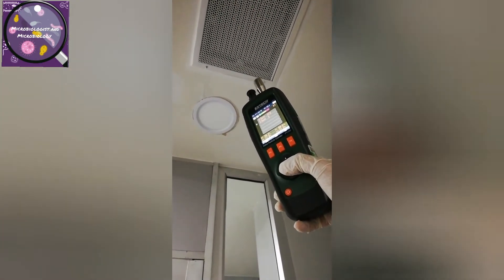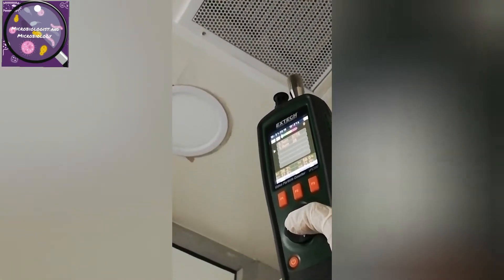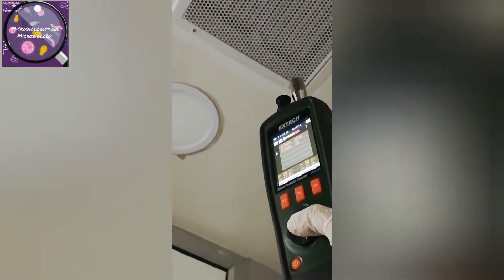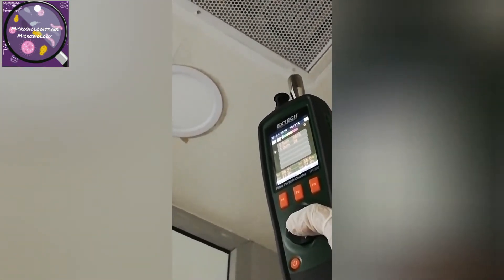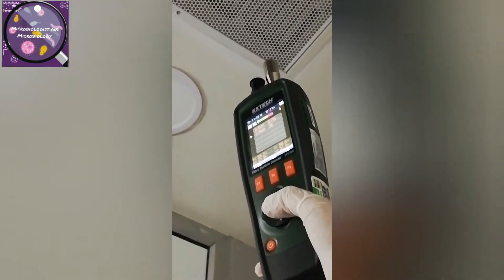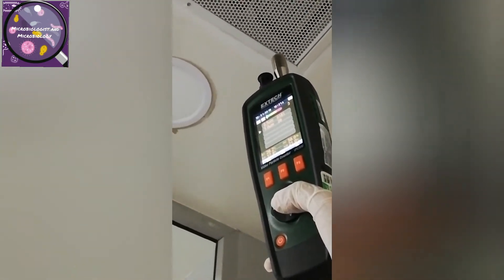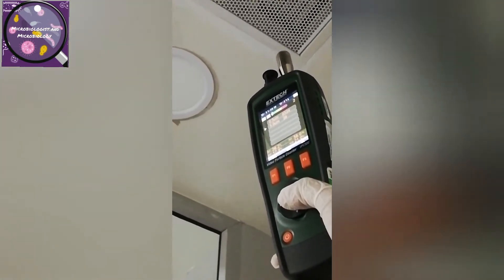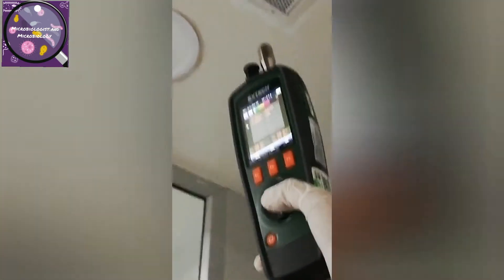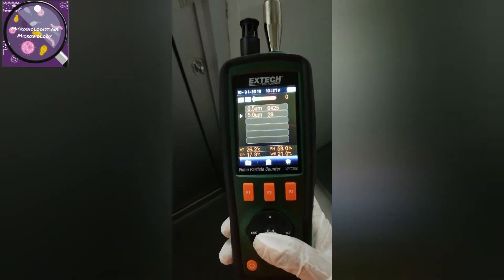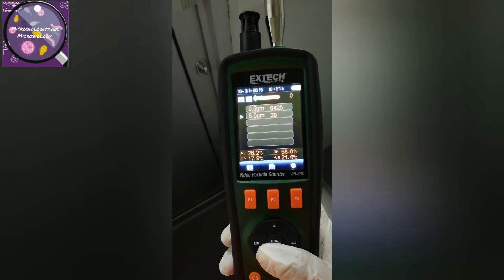Now you can see the particles being counted on the screen. I have selected two channels: 0.5 micrometer and 5 micrometer, as per our USP standards and WHO standards, because both of these sizes are very important.